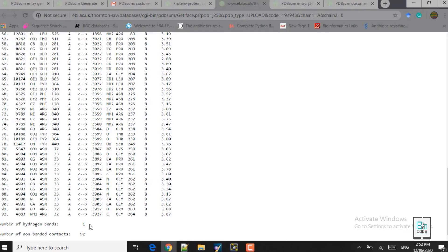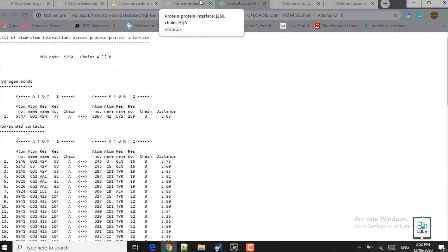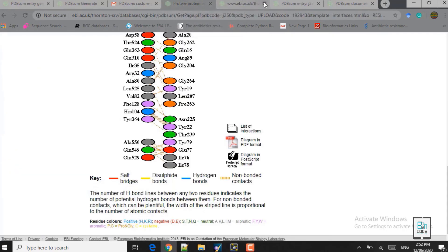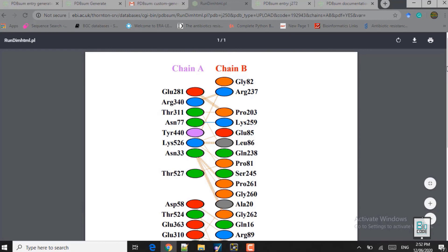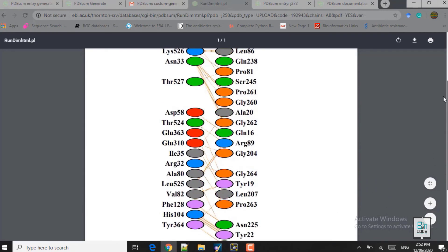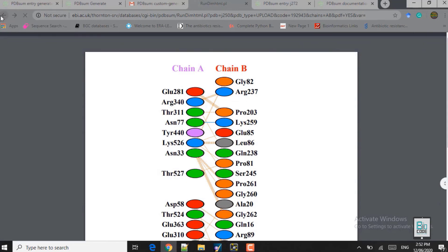So we will do the same analysis and check the hydrogen bond interactions for all of the complexes from the docking results, and we will select only that complex which has the highest number of hydrogen bond interactions between the ligand protein and the receptor protein. Now let's get back to the window and close this one. You can also get this plot in a PDF file and download it for your publication.